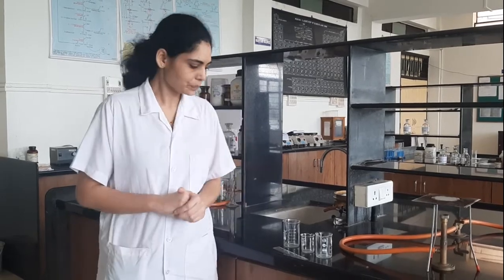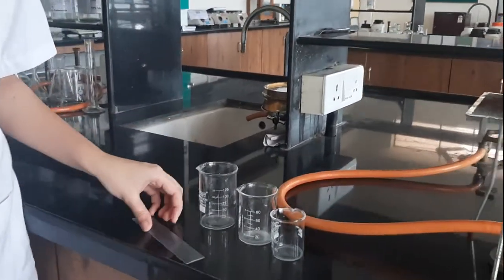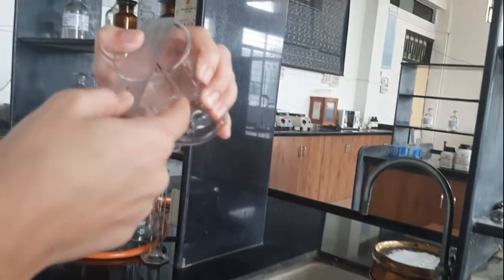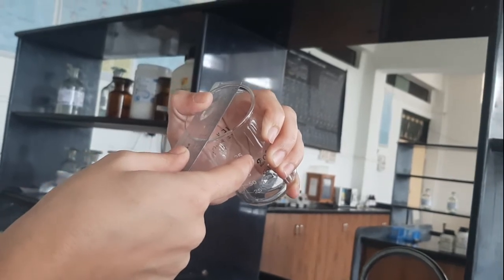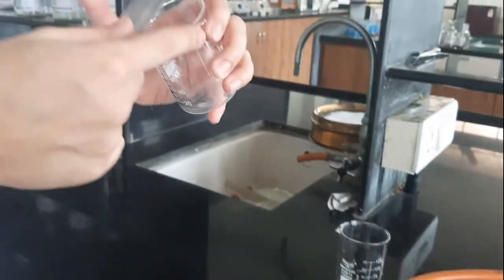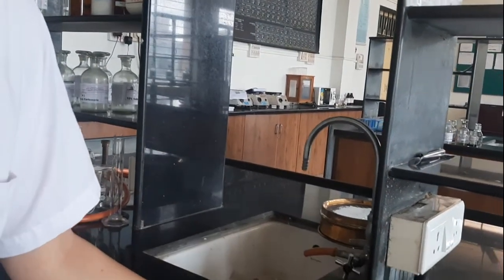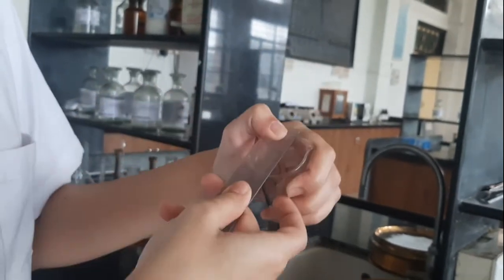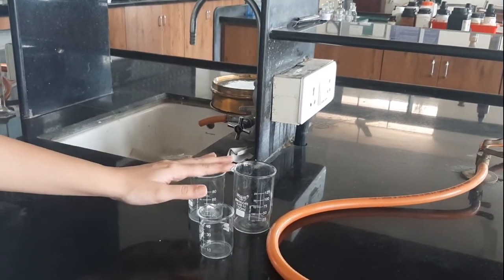Now we will start with part A. So first we have taken three beakers. You can see here these are the three beakers of different size, right? Now we will determine the actual radius of these three beakers. We have to determine the internal radius. The internal radius of beaker A is 5.2, beaker B is of the radius 4.8, and beaker C has the radius of 4 centimeters, right? Now we will fill each of these beakers with 50 ml of water and then we will heat it for 10 minutes.